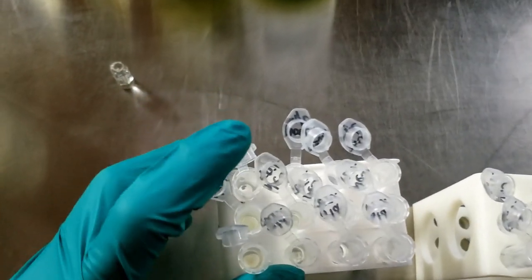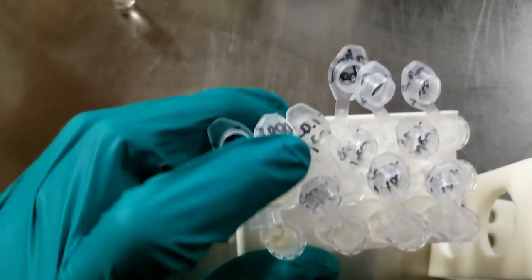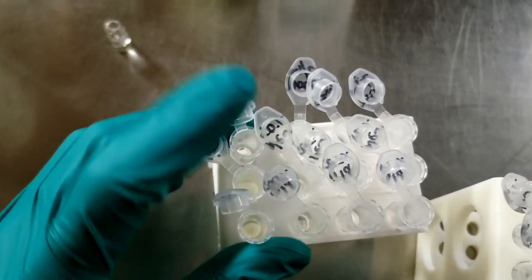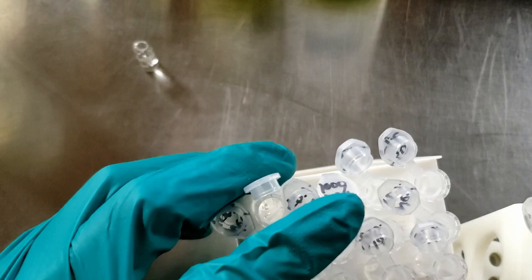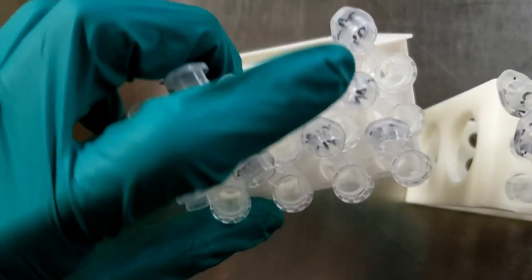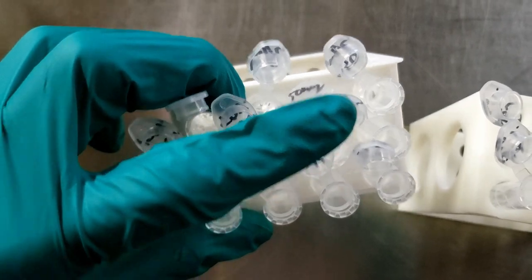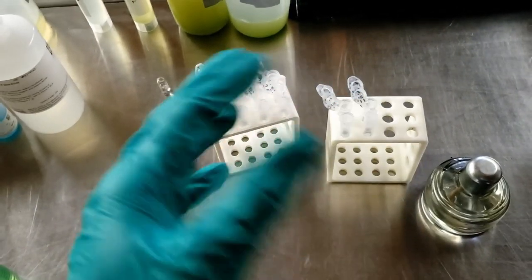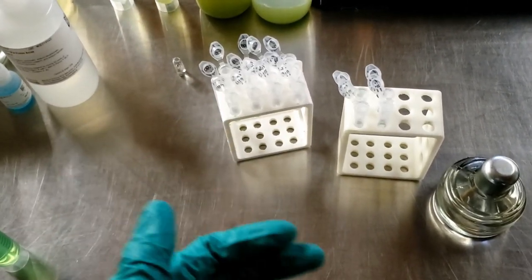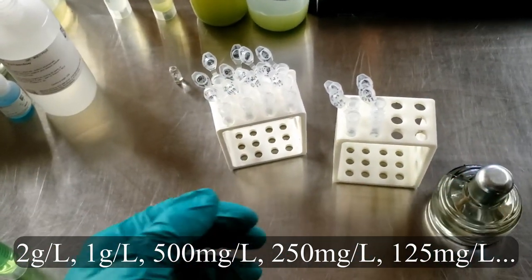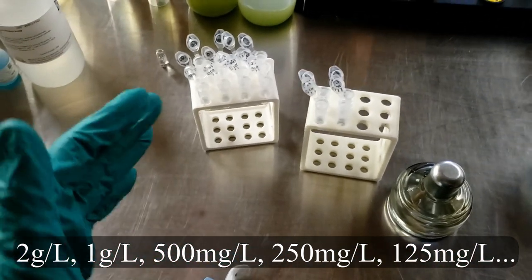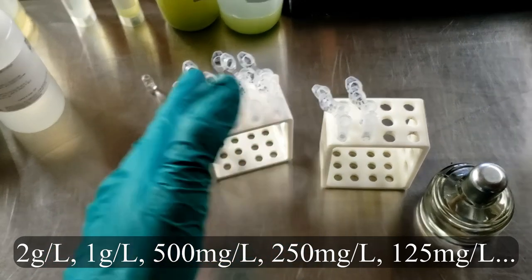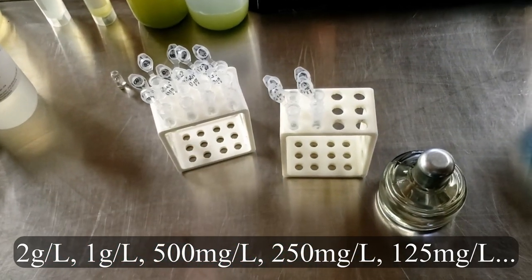What I've done here is I've prepared a serial dilution. This tube here has 2,000 milligrams per liter or 2 grams per liter. This is just the straight BSA solution. Then I diluted that 50% to 1 gram per liter and 50% again to 500 milligrams per liter. You can keep going down all the way to, I would recommend down to 62 and a half, which is 5 or 6 dilutions. You can go down a little bit further, especially if you have a spectrophotometer. But if you're just doing these measurements by eye, comparing the color by eye, then I wouldn't recommend doing anything past 62 and a half milligrams per liter.